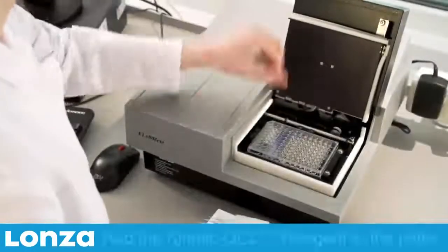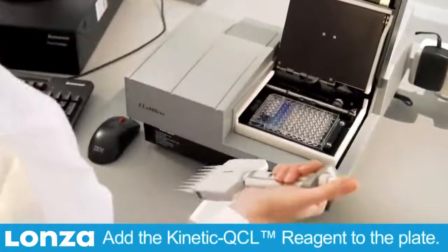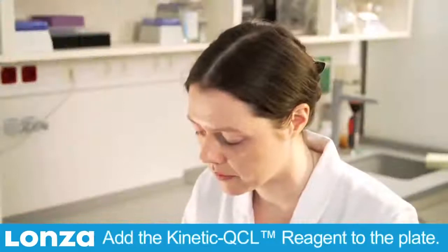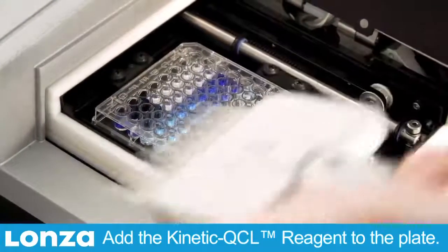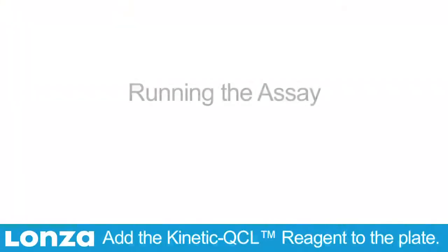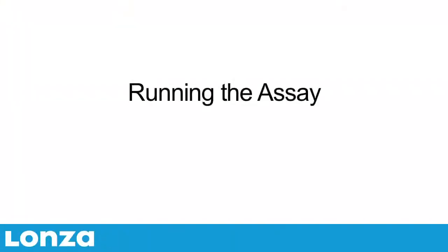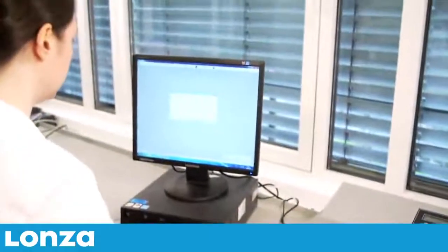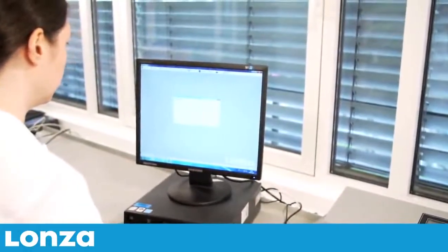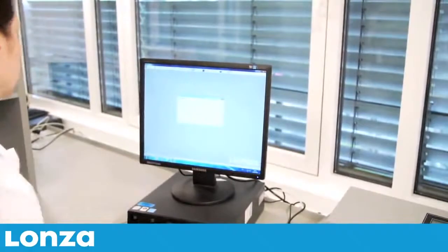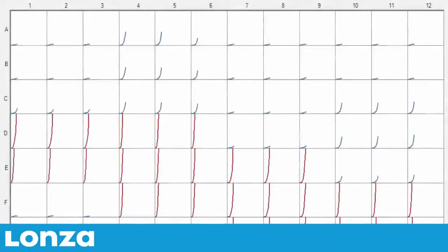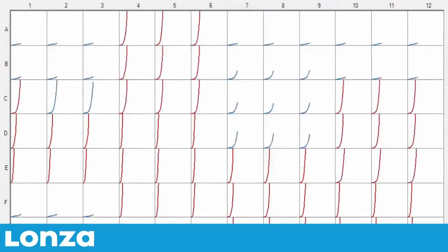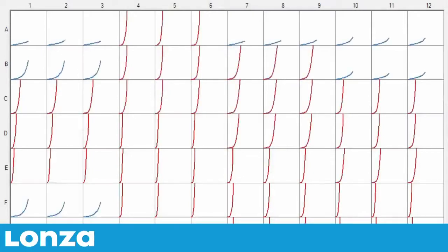At the end of the incubation period, dispense 100 microliters of the Kinetic QCL reagent into the appropriate wells of the microplate using an 8-channel pipetter. Click the OK button in the software to initiate the assay. The microplate reader and WinKQCL software continuously monitor the absorbance of each well of the microplate throughout the assay.